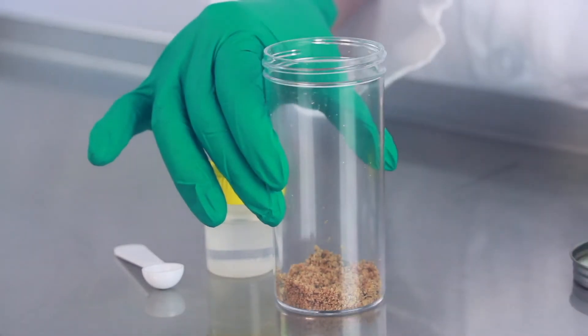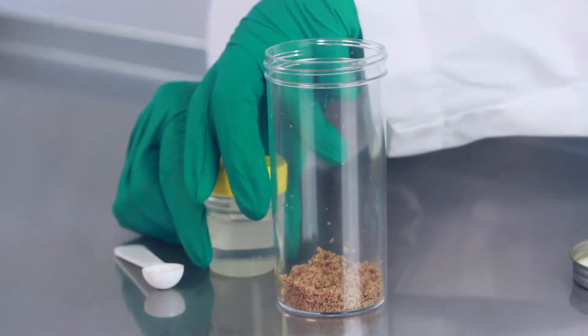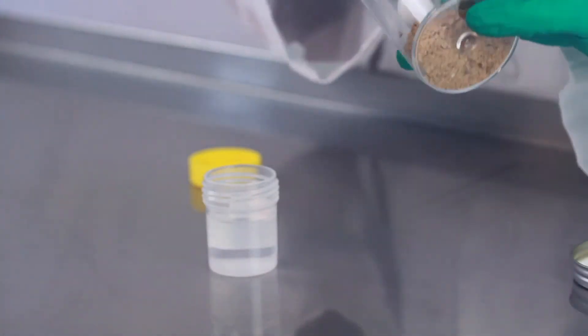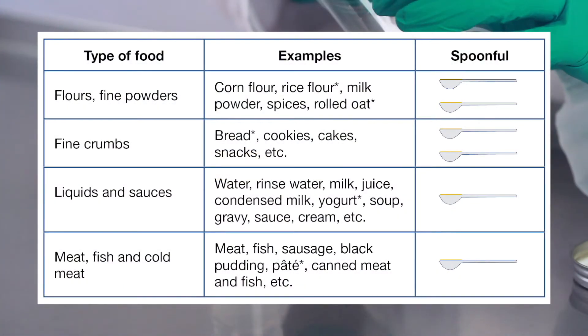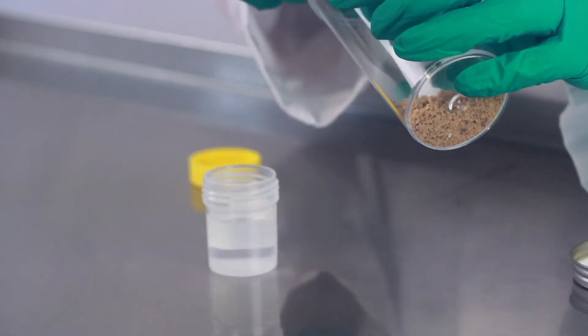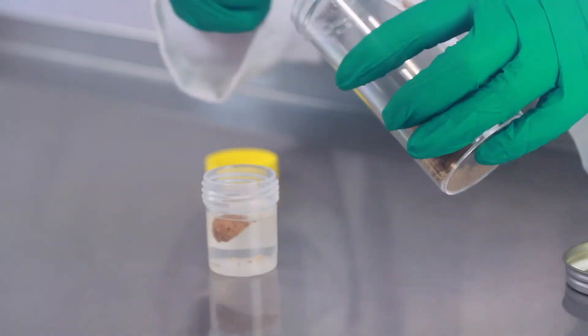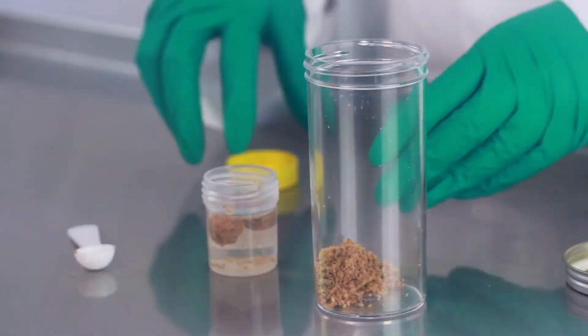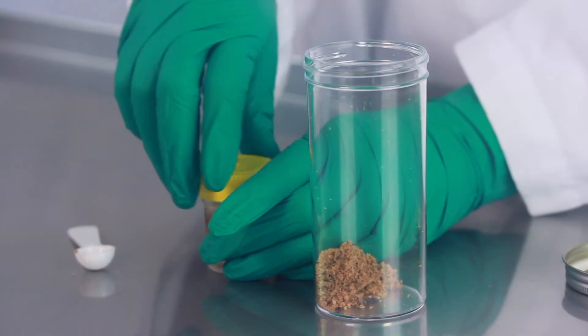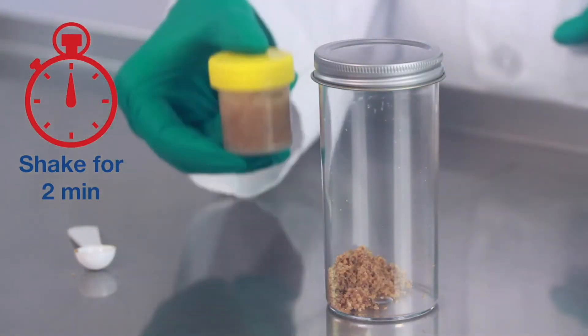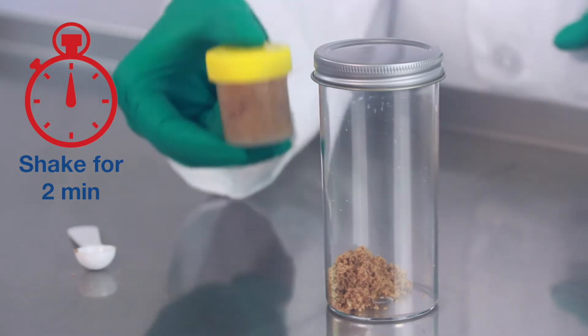Open the extraction bottle with the yellow cap and use a provided spoon. Fill the leveled spoonful amounts according to the table provided. Shake vigorously for two minutes and let settle for about five minutes so that any solids can rest at the bottom. Settling time will depend on the type of sample.